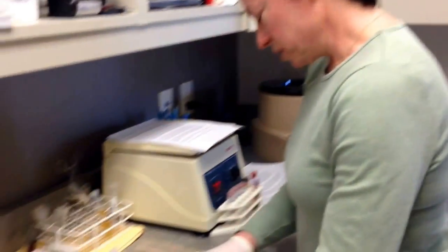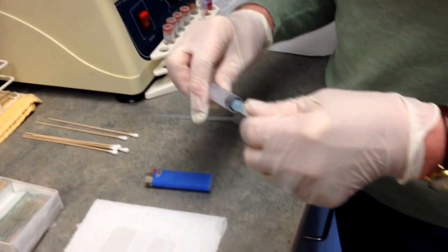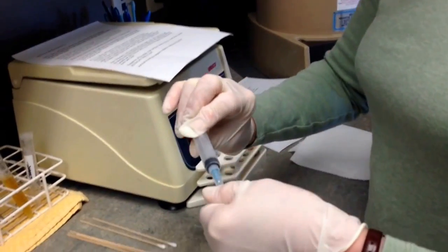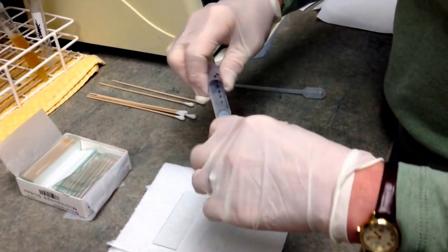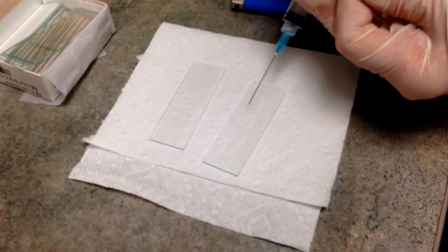Always start with new slides. If your sample was collected as a fine needle aspirate from a mass, your entire sample will very likely be in the needle. What you need to do is remove the syringe, draw back some air, reattach, position your needle over your slide, and spray your sample onto the slide.